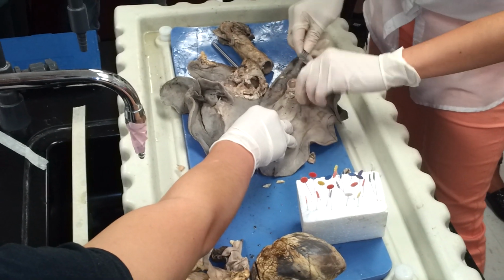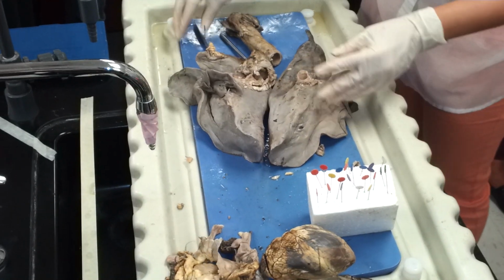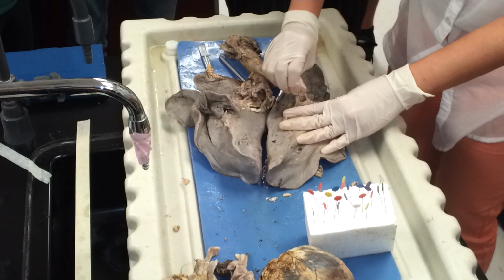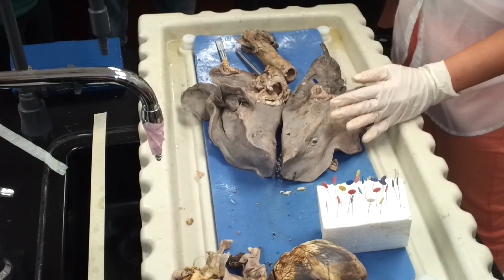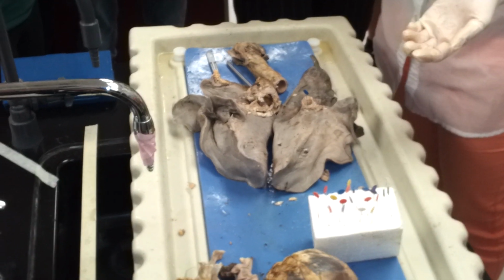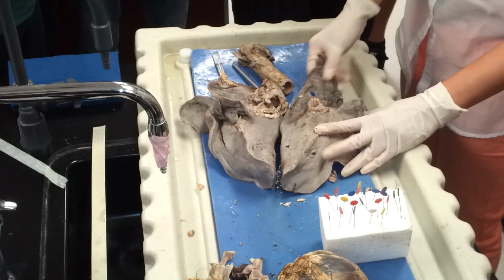Okay. Alright. So we have this structure, and that is what structure? Left primary bronchus or primary bronchus.